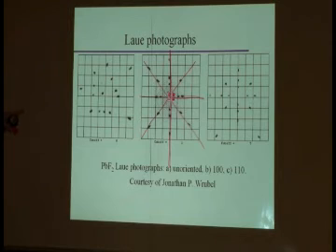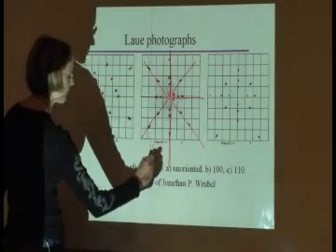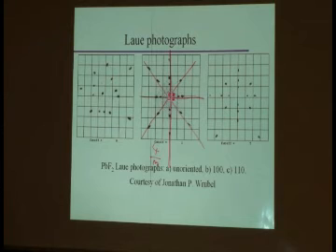So, what is that symmetry? Looks more like the 4/m, not the 2/m, right? So we really wouldn't need to look at the 110 anymore, right? Because we already know what it is. But if it is m3bar m, then the 110 should show twofold symmetry. So the question is, does it?